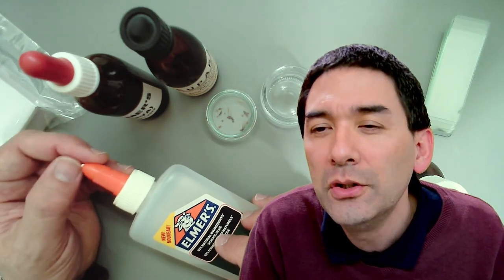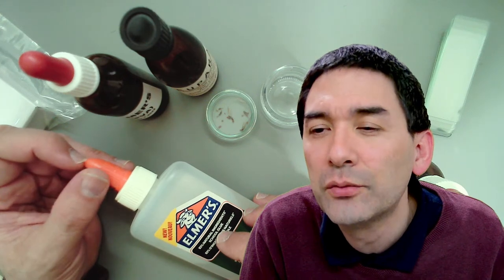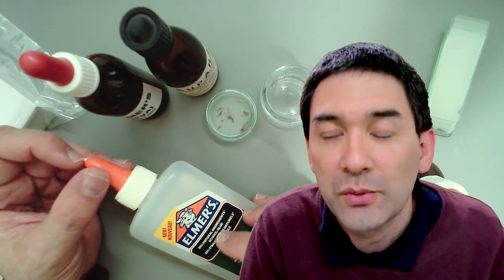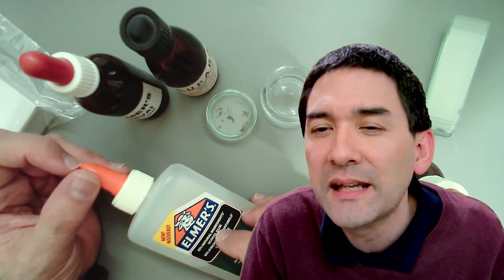Okay. Could you, for example, mount microbes like paramecium? If yes, would the result, the mounting medium, affect the cell and quality? Yes, the answer is definitely yes. I'll also talk about this. Could you also mount bigger microbes like stentor?